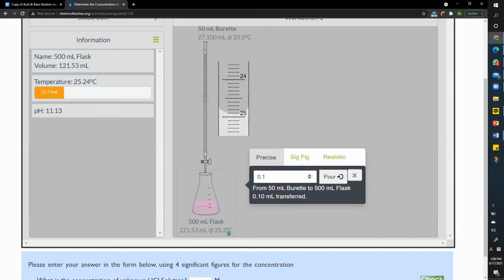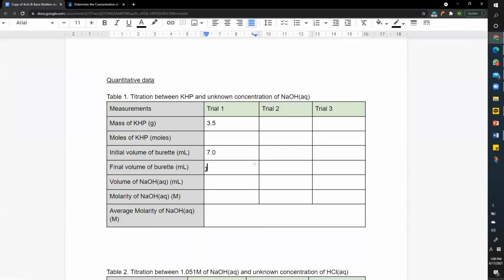I think I clicked once more. So it should be 24.8. Okay. I hope I got it right. I hope I only clicked once more. Okay, 24.8.